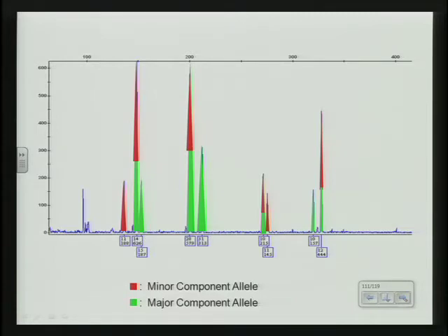So you see you've got your major and minor, which is already looking like almost a 1-to-1 ratio, even at D8, even though this really was 5-to-1. But because the degraded DNA just wasn't amping as well, obviously it's going to cut down on that. You look at the next one, D21, you start seeing it come down. The same thing. I broke it up to make it a little bit easier to see, but I just wanted to use the actual electropherograms at first.